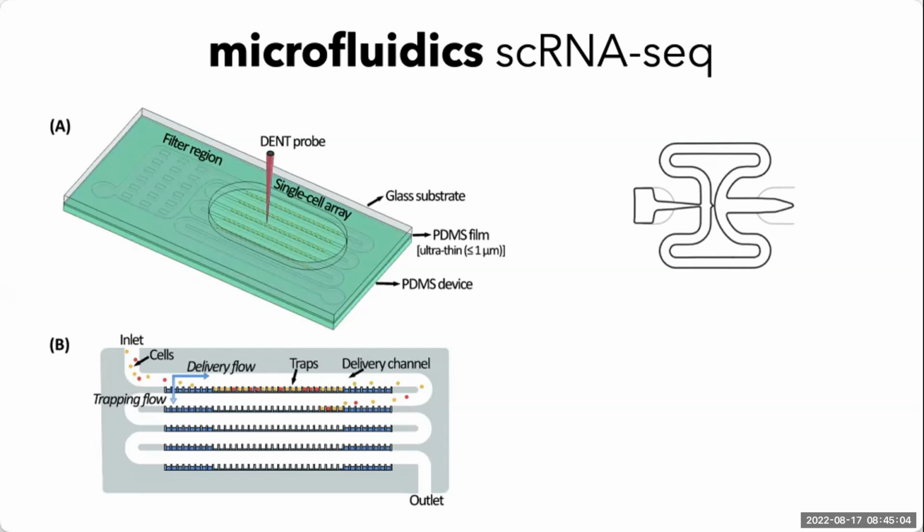So typically only around 10% of the cells that you take from the sample as input are actually captured in a microfluidic platform, and hence they are not very appropriate when we are dealing with rare cell types, or cells with a very small number of inputs, or tissue types that are extremely heterogeneous in nature.